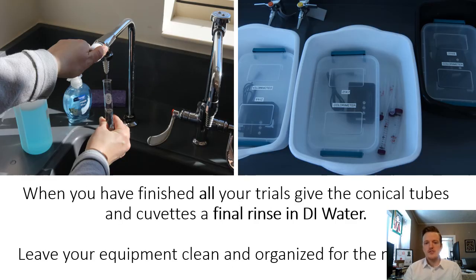When you've finished, you have to rinse everything with DI water, which is deionized water. It's just very clean water, which a lot of the labs at OU have an actual tap that will dispense the DI water. So then you just leave your equipment clean and organized for the next lab.